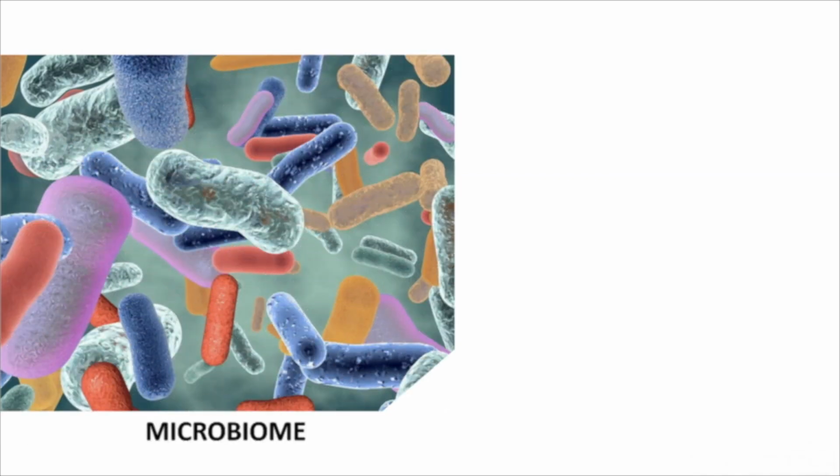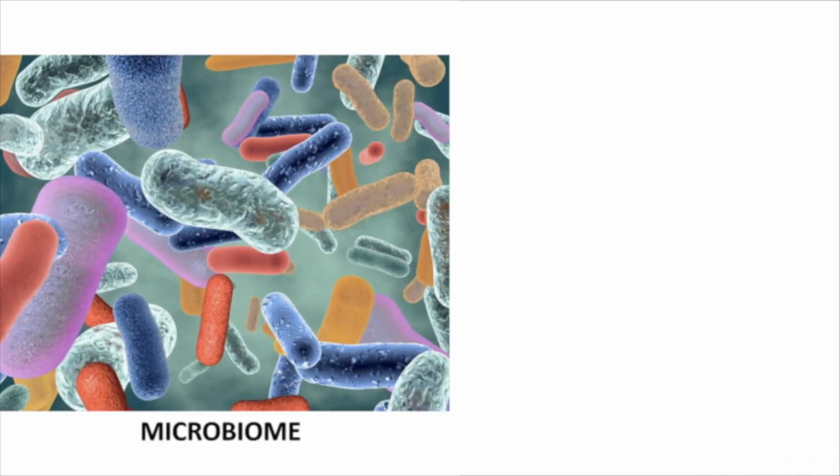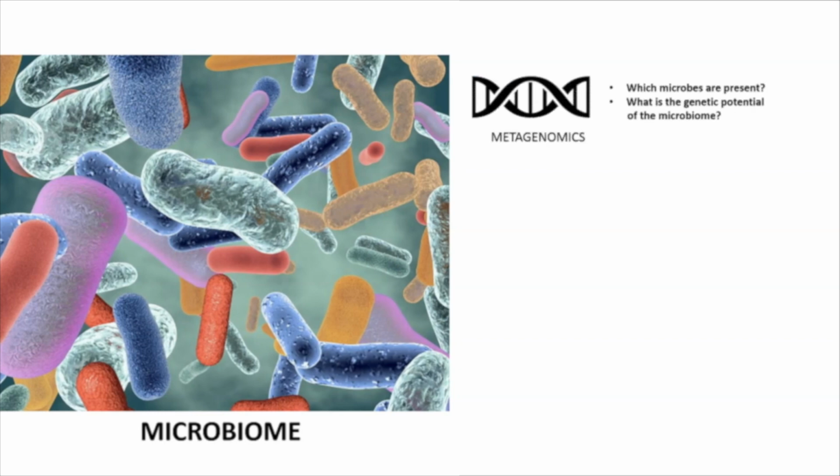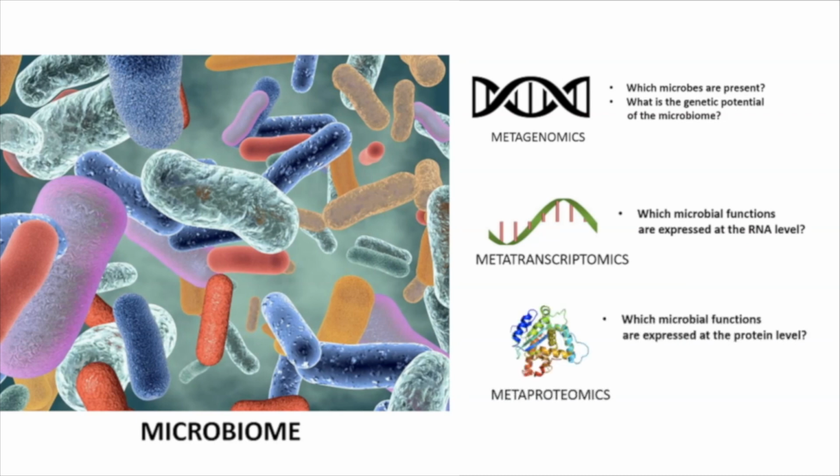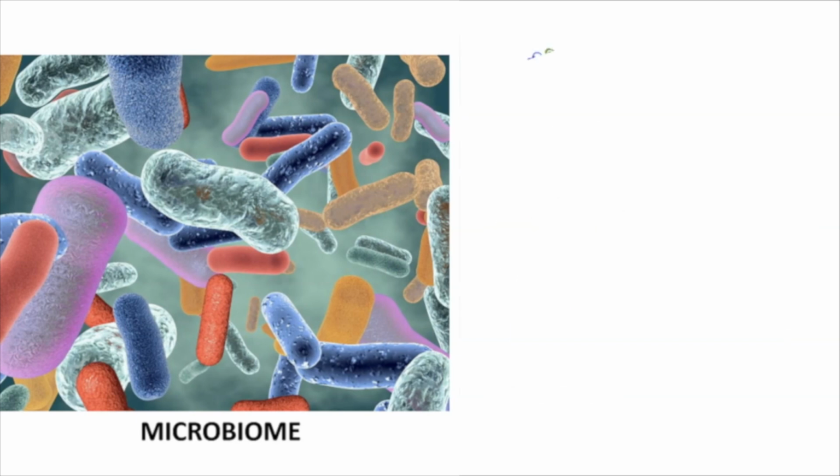Microbiome research, or the research of the effect of microorganisms present in a host or an environment, has provided deep insights into how it affects human health, disease, and also the environment. Recent studies have also shown the effects and interactions of human microbiota with its host to influence cancer physiology. Multi-omics research for microbiome involves using metagenomics, which looks at microbial DNA, metatranscriptomics, which is concerned with microbial RNA, and metaproteomics, which examines microbial proteins for microbiome research.